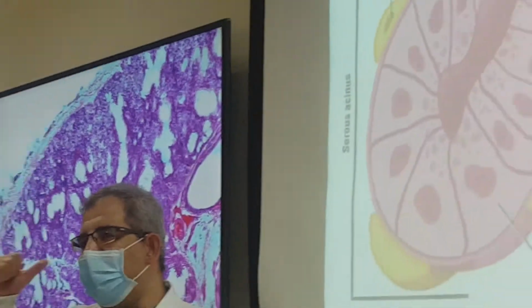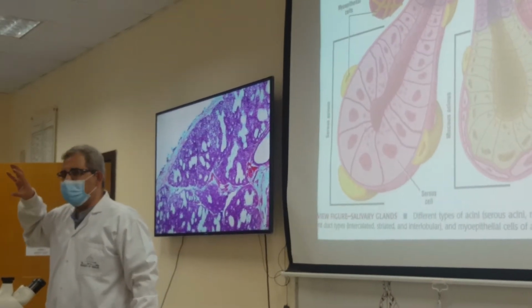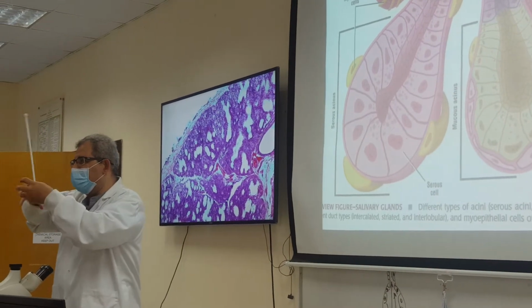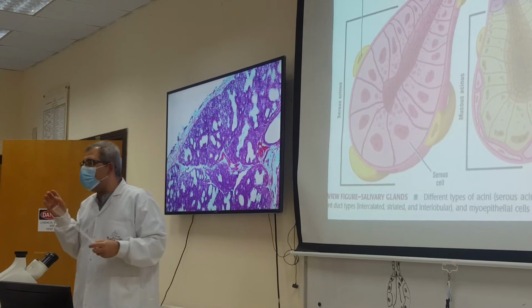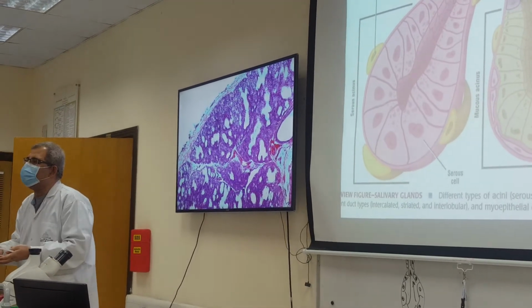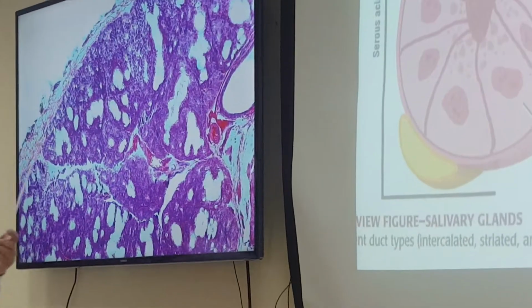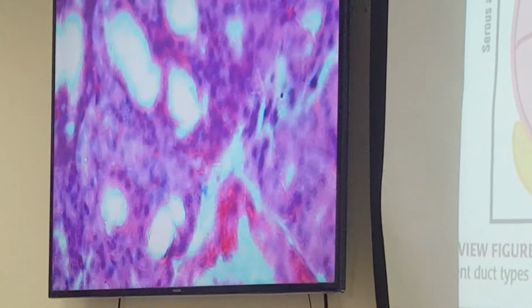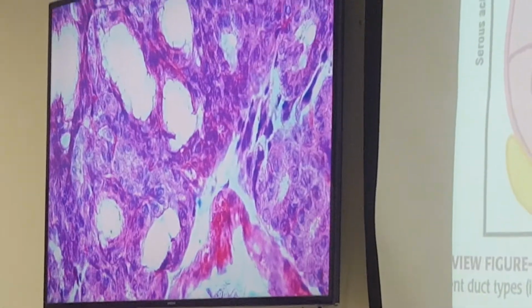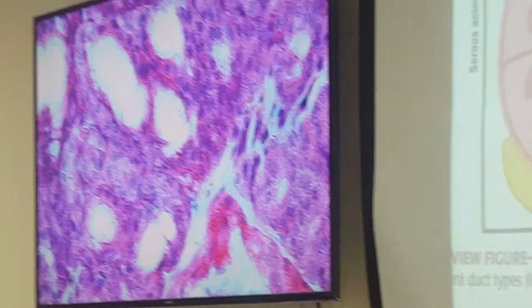Do you remember what the shape of the goblet cells was? It was mucus, with a foamy appearance inside. We will take this as an indication of the mucus acinus appearance. So here, where are the cells that really give a foamy appearance? We need to go to 40x. Okay. I need you to compare the appearance.